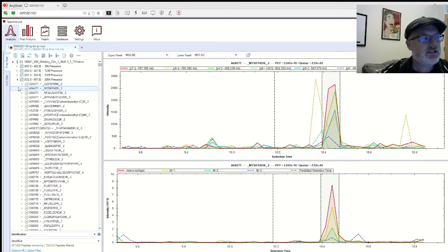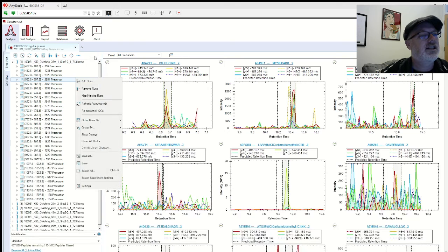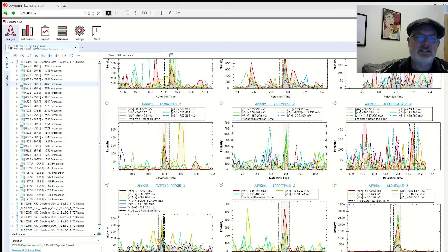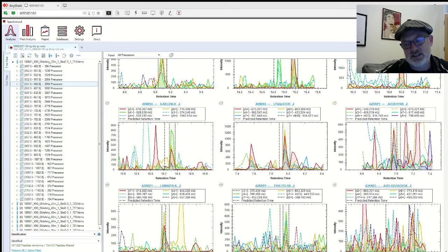Okay. So we can group this by precursor range. If you're an analytical chemist or a mass spectrometrist, this is cool. If you're a biologist, not so useful. Unless you're looking for, oh, that's cool. You can look at all of them here. Oh, that's neat. And you can see some of them look good. These don't. That might be imputed.